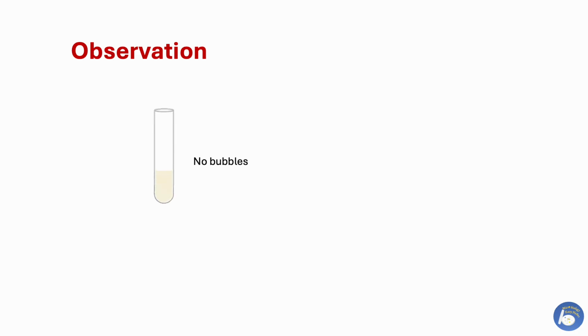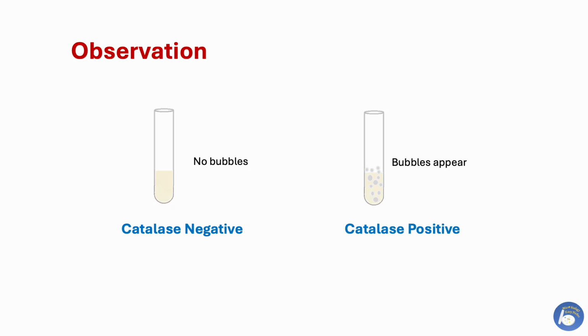If there are no bubbles in the test tube, it means sample is catalase negative. If bubbles appear, it means the sample is catalase positive.